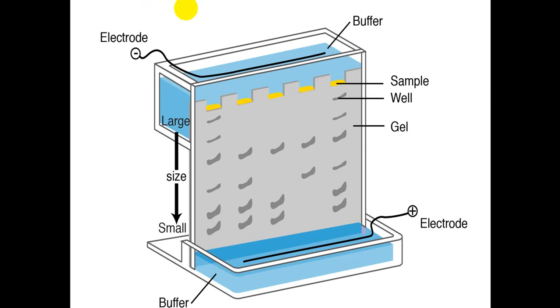So this is polyacrylamide gel. Agarose gel is from seaweed, so it is not so strong, but this is a synthetic, chemically produced gel. Very strong, robust, with a lot of cross-linking, so you can cast it vertically, whereas agarose gel, produced from seaweed, has to lie down horizontally. Agarose gel has to lie flat on the ground, whereas this one is standing.